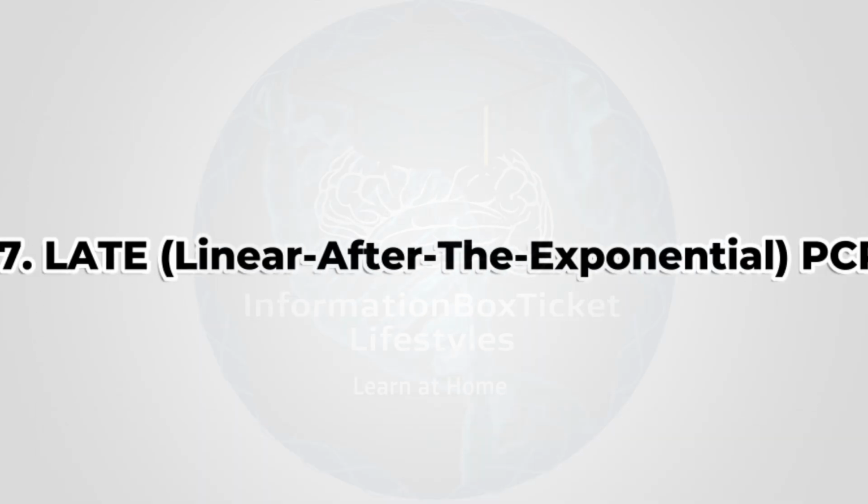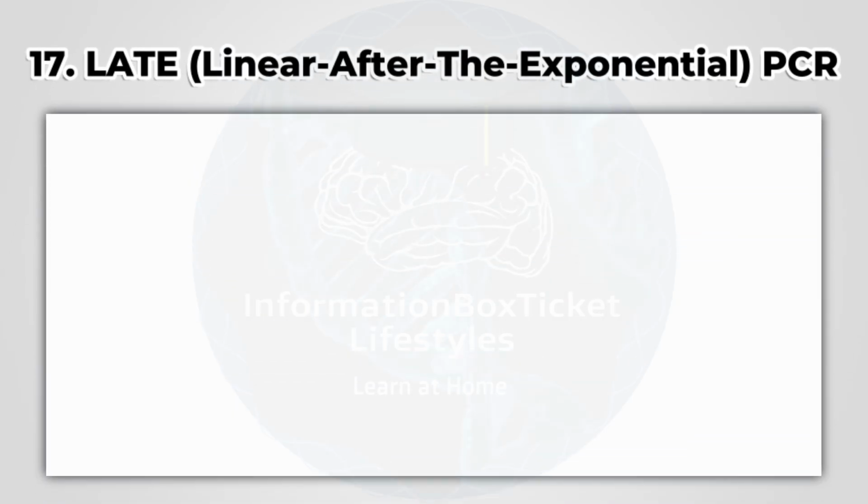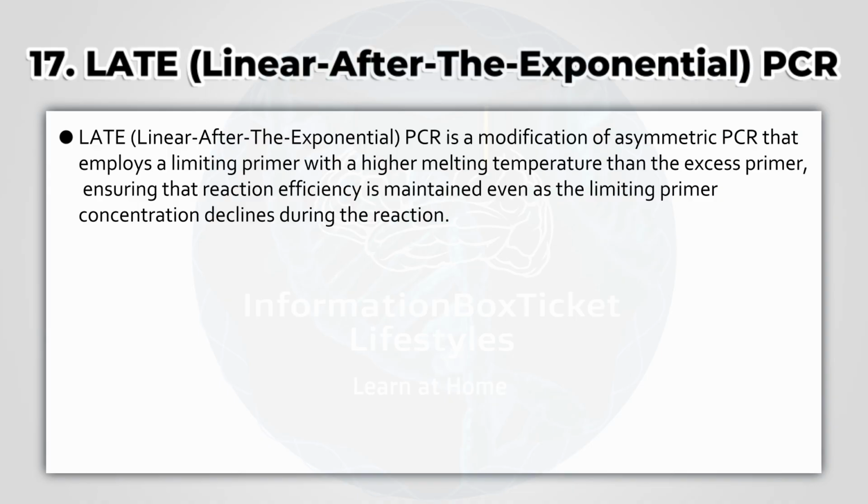17. Linear-after-the-exponential, LATE PCR. LATE PCR is a modification of asymmetric PCR that employs a limiting primer with a higher melting temperature than the excess primer, ensuring that reaction efficiency is maintained even as the limiting primer concentration declines during the reaction.